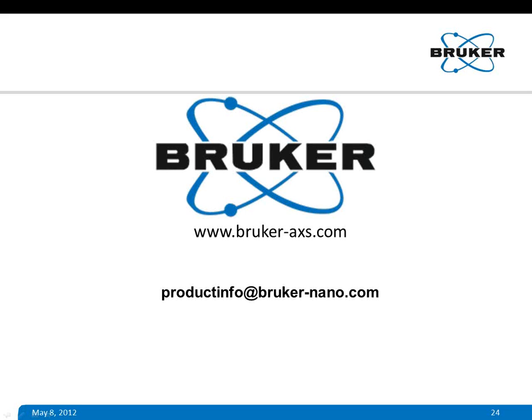When you are not using this reference electrode, as usual, you need to take it out, remove the Luggin capillary, rinse it with double distilled water, and preserve it in a preserving solution. Again, it depends on what type of electrode you are using. If it is AgCl, put it into 1 molar potassium chloride solution for preserving. You can preserve it for months, no problem. It will not change. Again, if there is any doubt, you can have a set of reference electrodes which are not being used for experiments, and you can compare the standard potential with other reference electrodes, just to make sure that your reference electrode in use is in good shape.